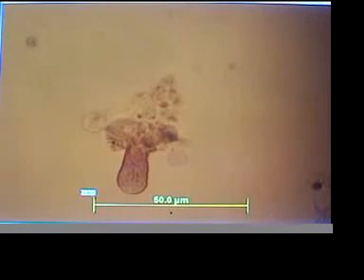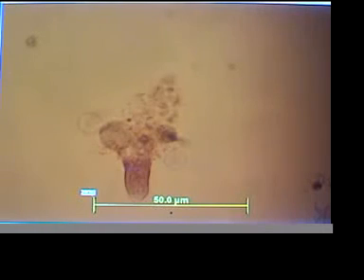If I get a chance, I'll give you the grid location in a moment, but this is too important to film. Still needs a little more dark contrasting, I think. Here we go. Look at the bottom, reshaping, exploding. That was an excellent example.